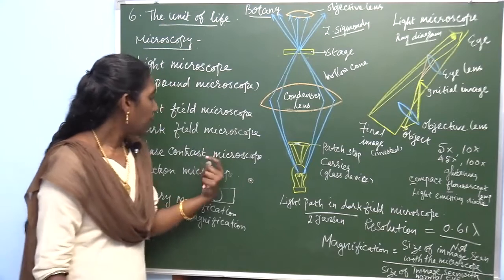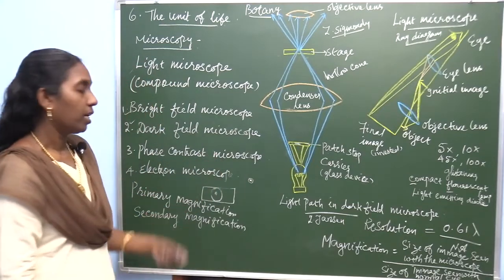Then 2 more types of microscope are there, the phase contrast microscope and the electron microscope.